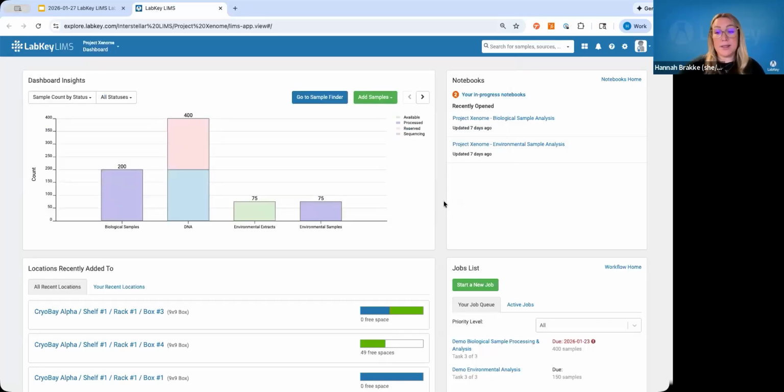And on the dashboard of this home base here, we're able to see all of the samples within the system, both samples that we have currently within our lab, but then anything that we have processed. So you don't have to traipse through any audit logs if you need to troubleshoot or understand what happened in the past. And the point here isn't these exact numbers, it's really getting that overview into understanding the shape of the work in the lab. I, as an administrator, have customized all of these, and so this would be likely very different for the individual labs tracking their samples within LIMS.